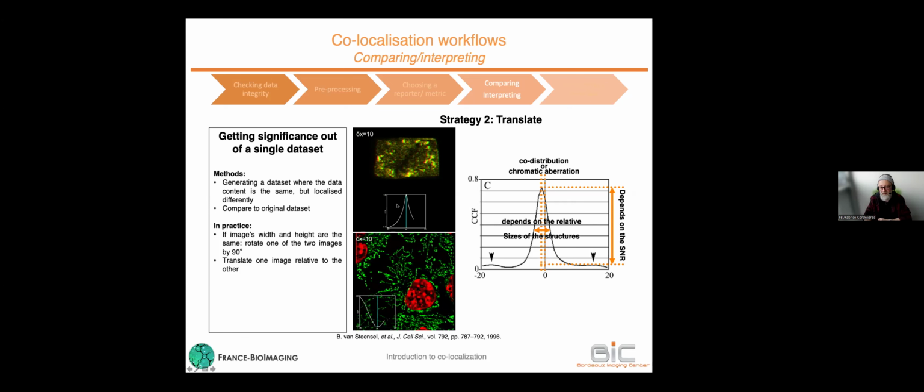Be careful about this kind of methodology. Of course, if you've got repetitive patterns, if you're working on muscle, for instance, you may have periodical bumps in the graph. You just have to know it in order to be able to interpret the kind of graph you get.